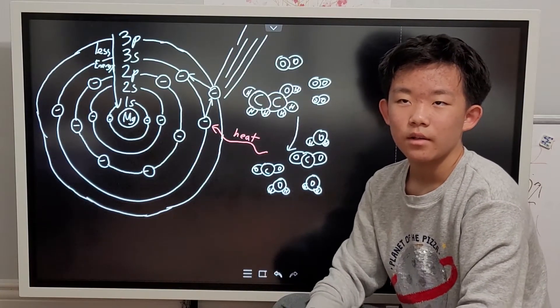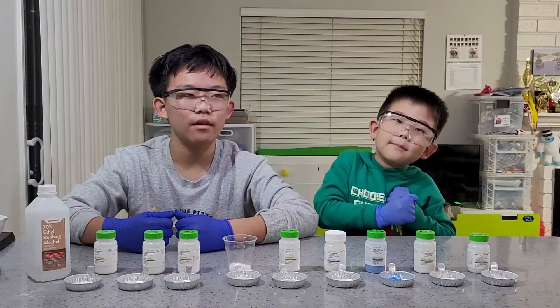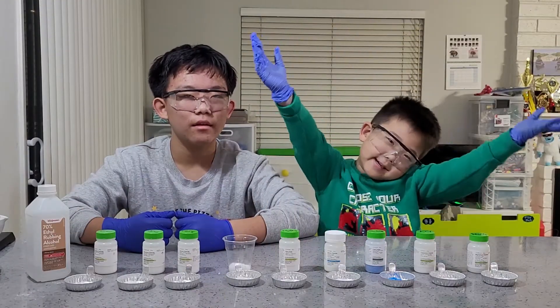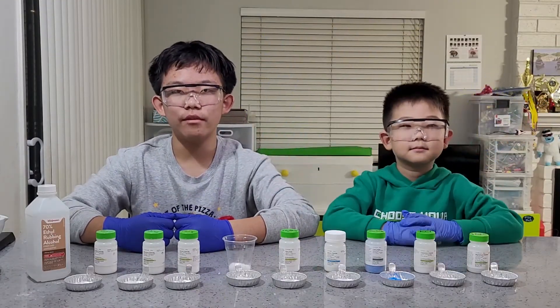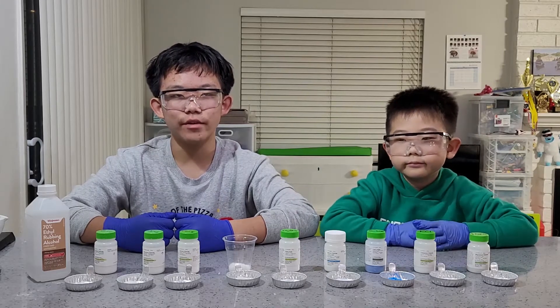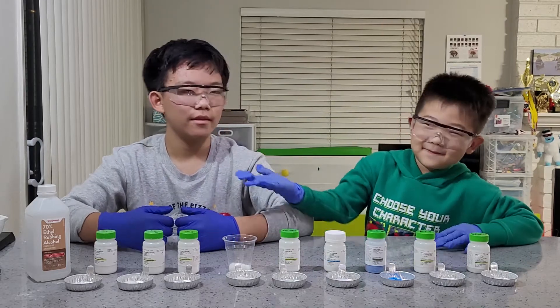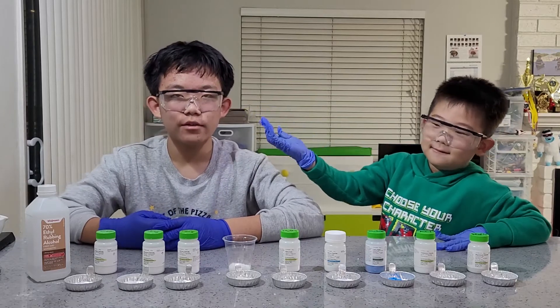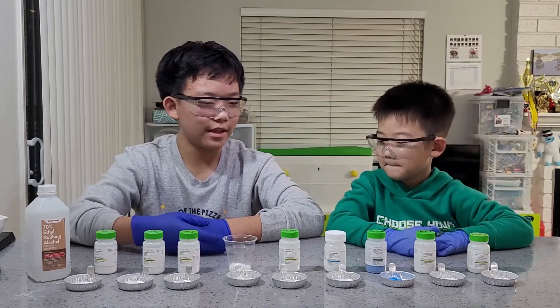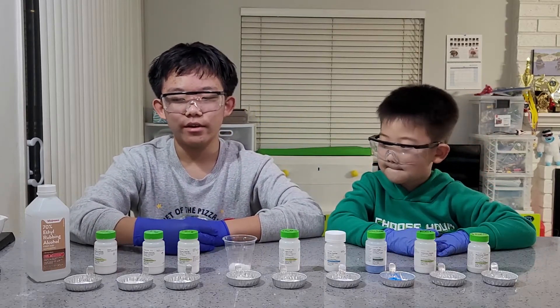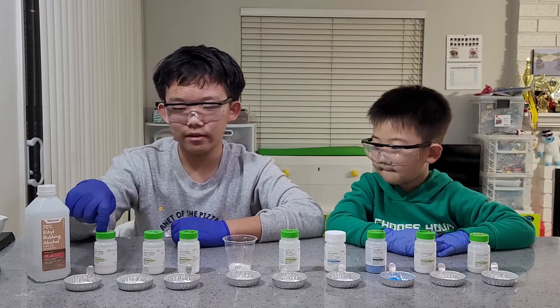Now let's see if it will actually work with our chemicals. Welcome back everyone — now that you know what happened in theory, let's see if it works in real life. I have a variety of different chemical reagents. Lithium chloride will provide us with a red flame.